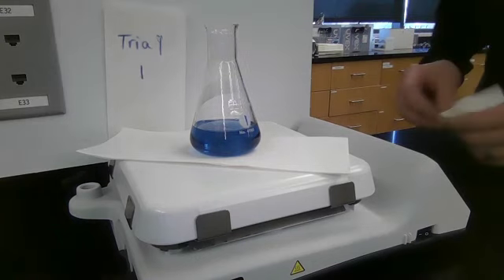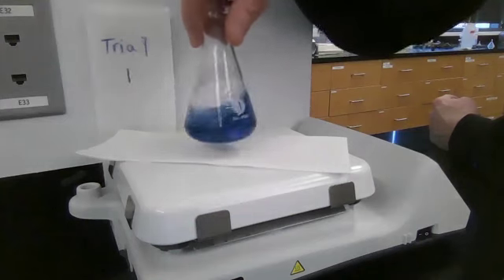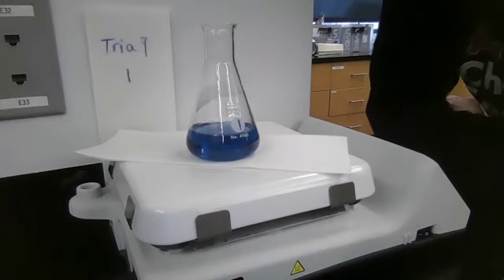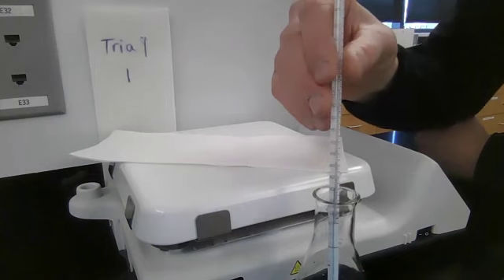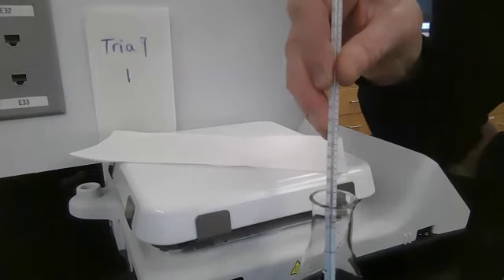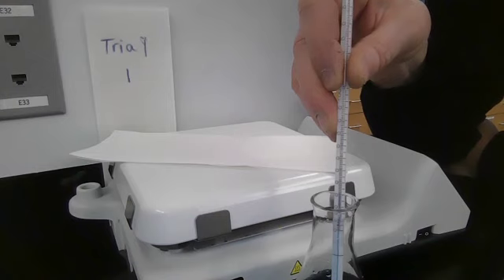But you guys take that time in seconds to the nearest second. That's a beautiful blue. Is it tea time? I think, yeah. All right, that was a repeat of trial 1. And now we will pause or even stop recording.